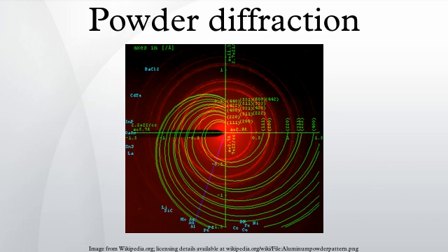It is mostly used to characterize and identify phases, and to refine details of an already known structure, rather than solving unknown structures. The great advantages of the technique are simplicity of sample preparation, rapidity of measurement, the ability to analyze mixed phases, for example soil samples, and in situ structure determination. By contrast, growth and mounting of large single crystals is notoriously difficult. In fact, there are many materials for which, despite many attempts, it has not proven possible to obtain single crystals.